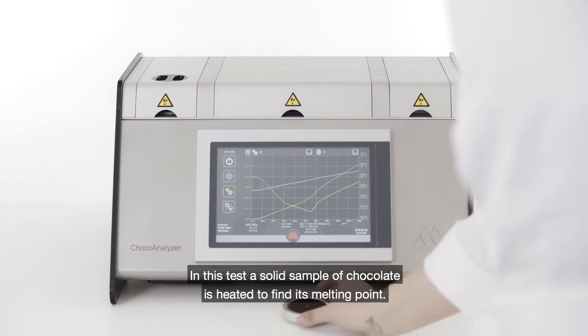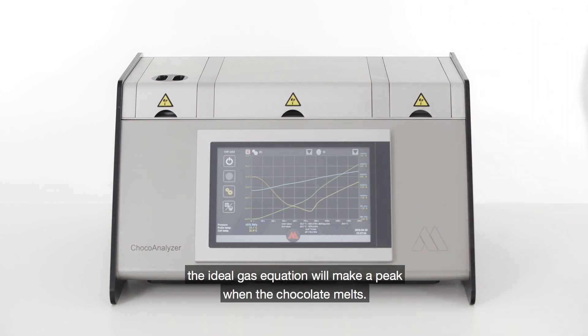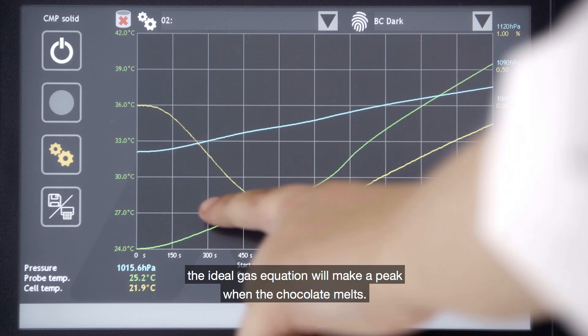In this test, a solid sample of chocolate is heated to find its melting point. By measuring the temperature and pressure change, the ideal gas equation will make a peak when the chocolate melts.